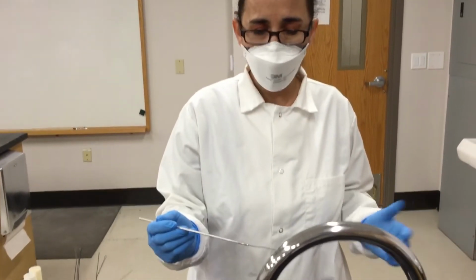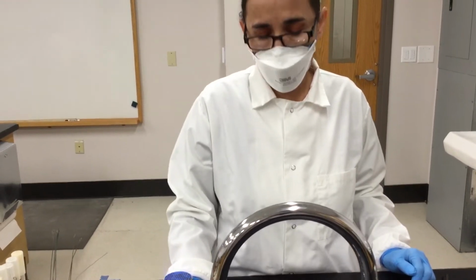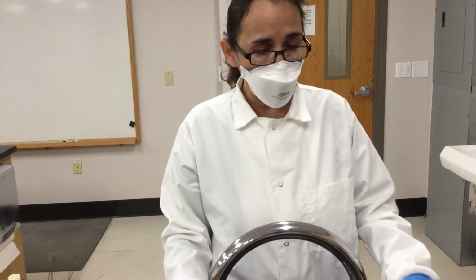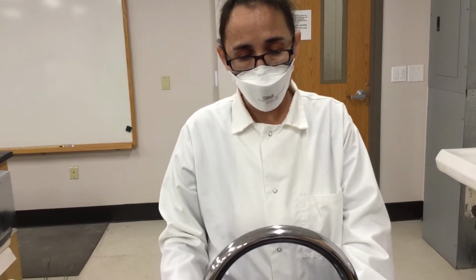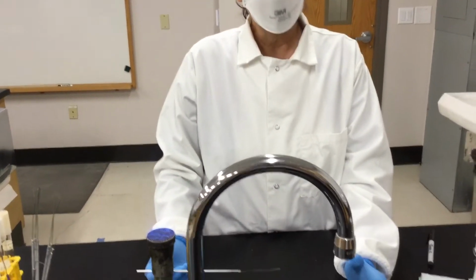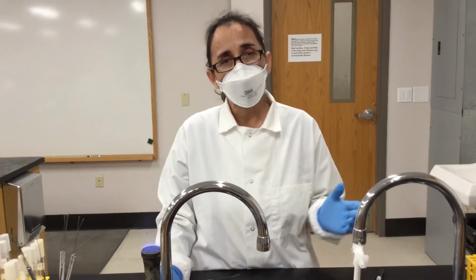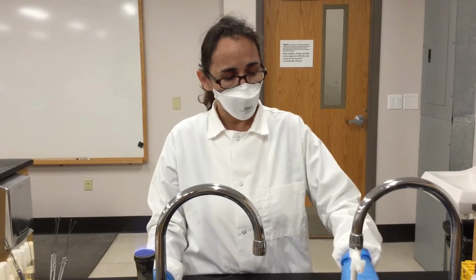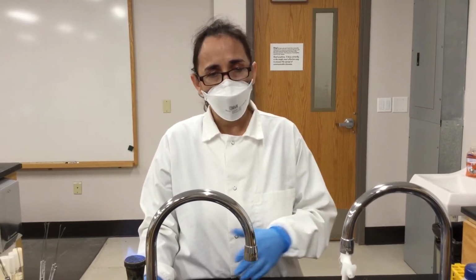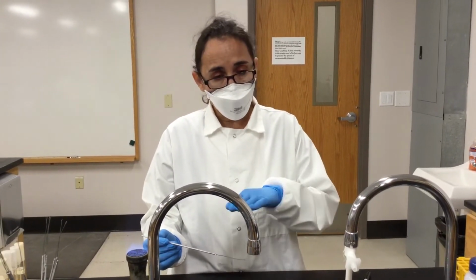That's one of the longest steps. Let it cool for, let's say, around a minute, and then from there you will grab your bacterial sample, and then you will start doing your smear. Now when you are doing smears from a liquid media, you don't need to previously add water as your manual indicates, and this is just because water acts as an agent to help the smear become very thin.